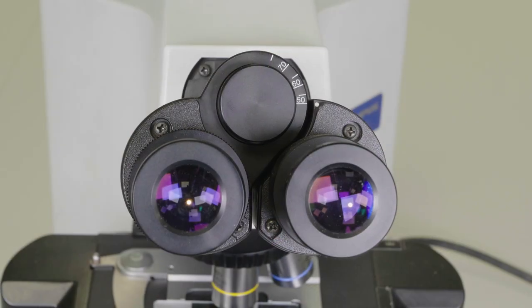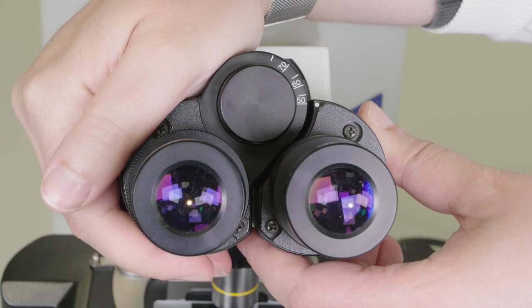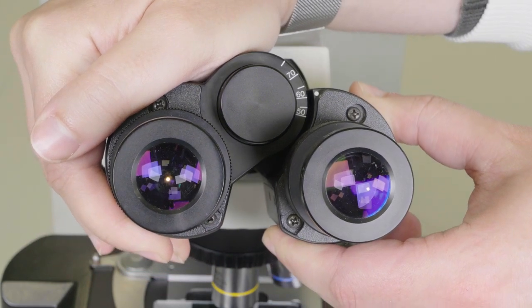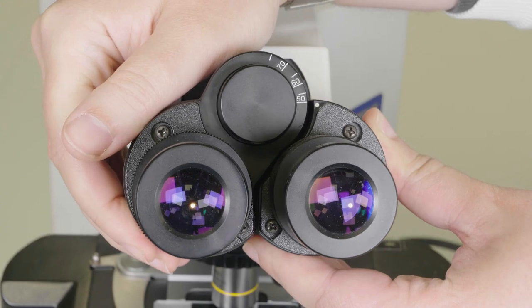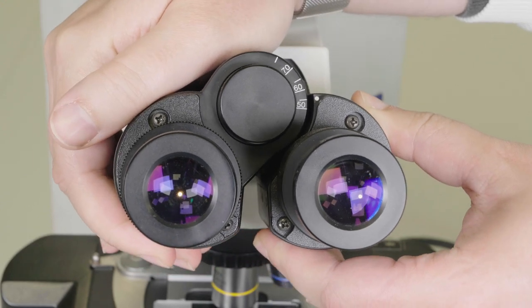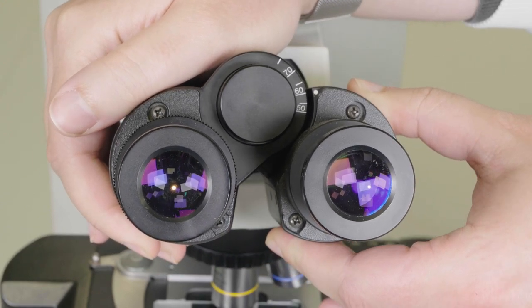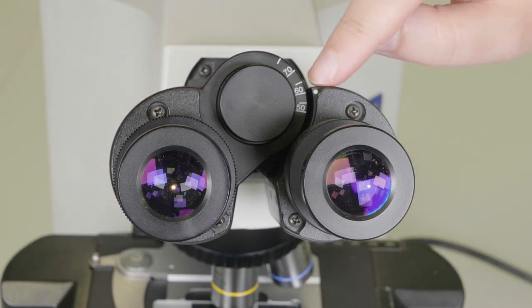Next, we need to adjust the eyepiece. All our microscopes are binocular, so you need to adjust the interocular distance until you can see a single image when looking down the microscope with both eyes. Once you have this distance, note down where the dot is located on the scale so you can quickly set up the microscope for next time.